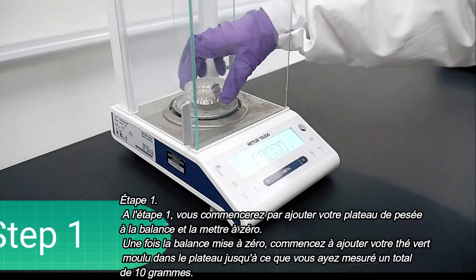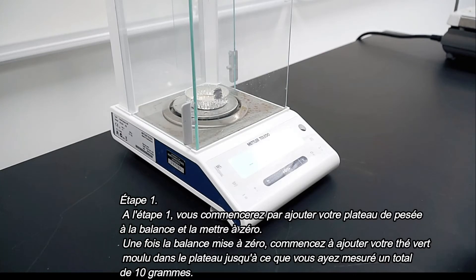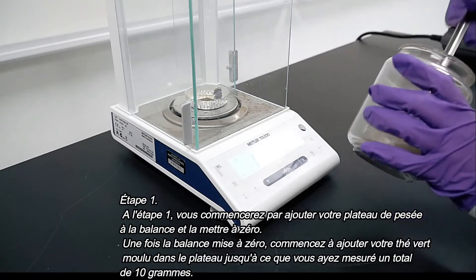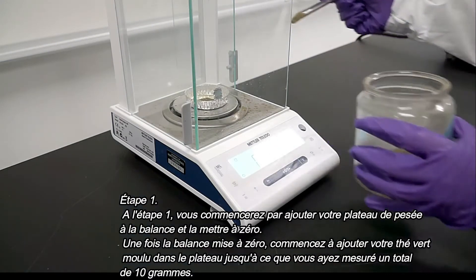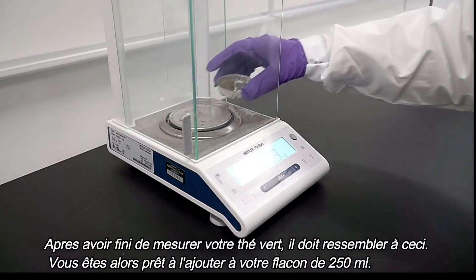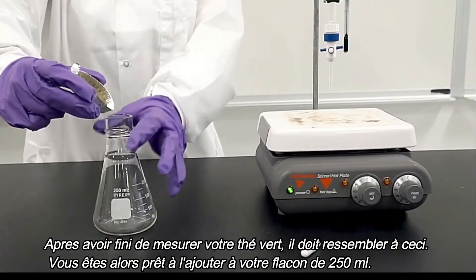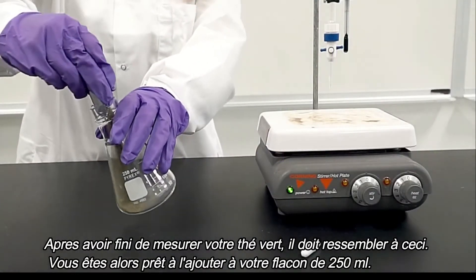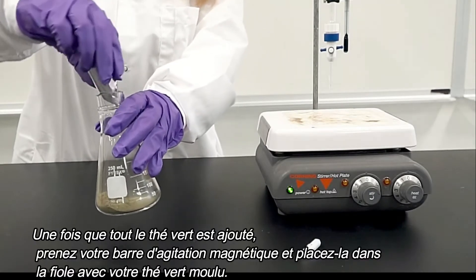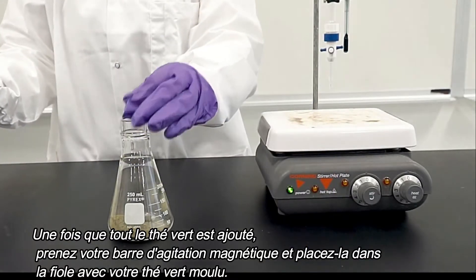For step one, you will begin by adding your weigh tray to the scale and zeroing it. Once your scale is zeroed, begin adding your finely ground green tea to the tray until you have measured out a total of 10 grams. Once you have finished measuring your green tea, it should look something like this. You are then ready to add it to your 250 milliliter flask. Once all the green tea is added, grab your magnetic stirring bar and place it into the flask with your ground green tea.